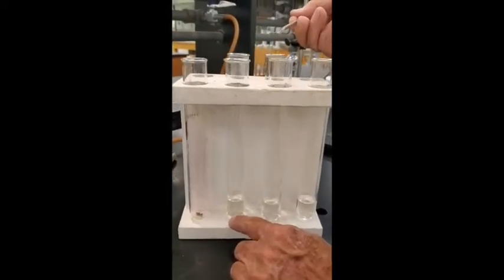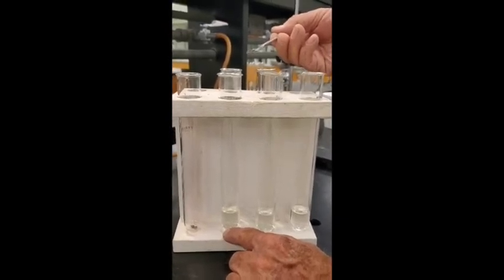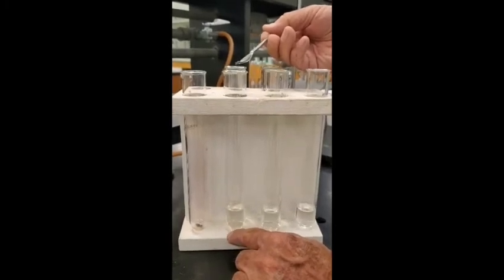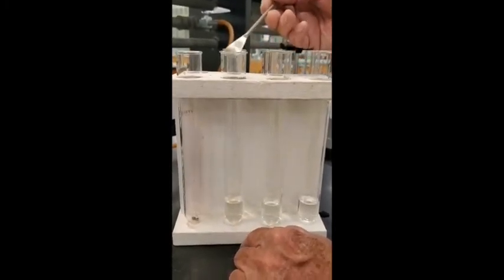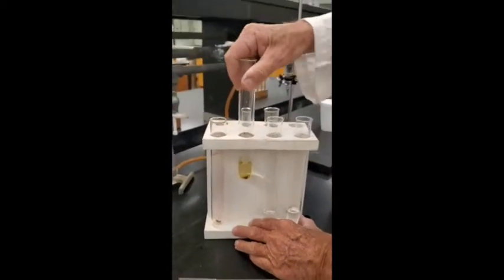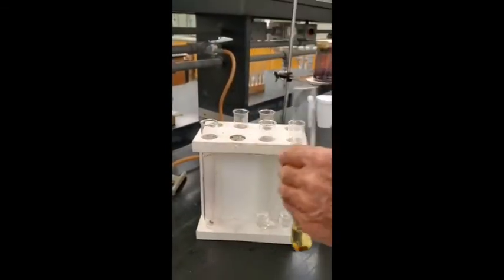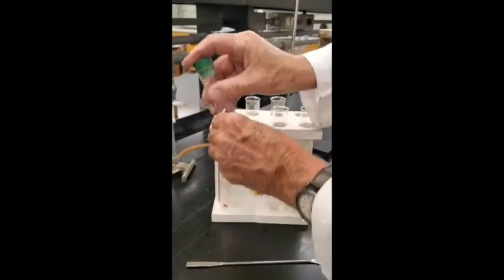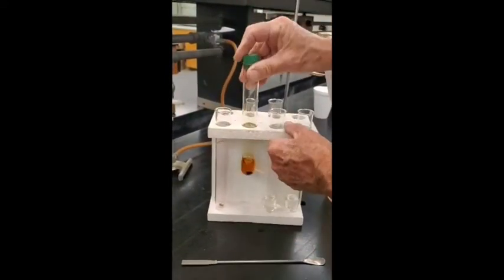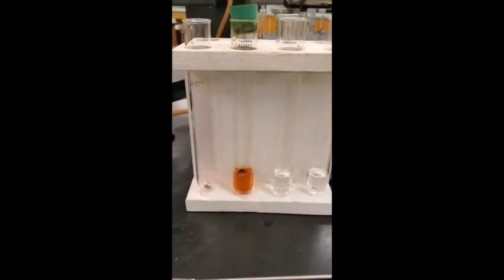And I told you, we saw in the experiment last week, that iodine actually reacts with iodide ion to make the triiodide ion, which is dark brown in color. Let's see if there's any evidence of this. Let's shake it up. And we'll see if that happens. You can see the color's already developing. It's kind of orangish, but it's brown when it gets more intense.